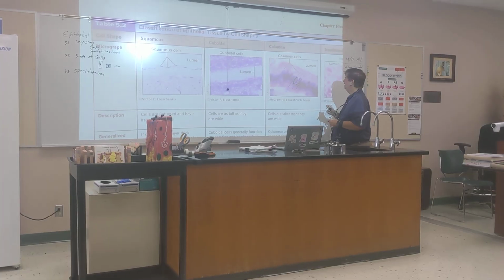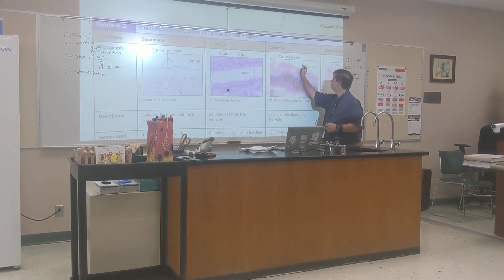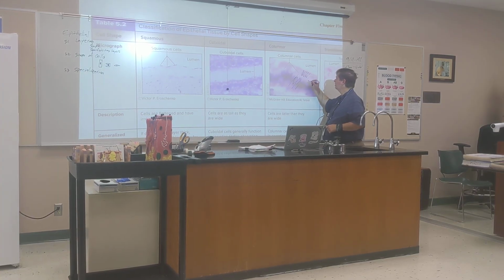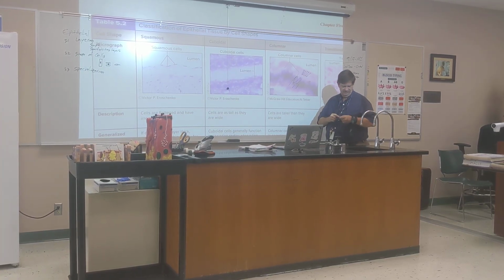All right. Let's go one further. These are columnar cells with this fuzzy looking thing here. That's the brush border.